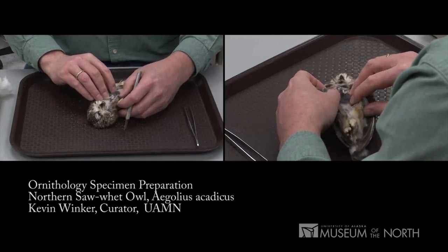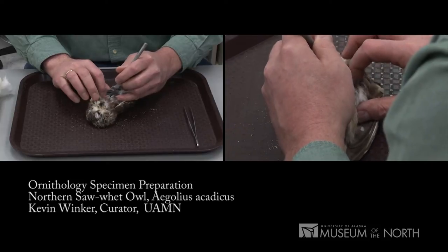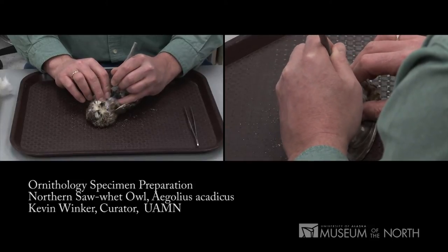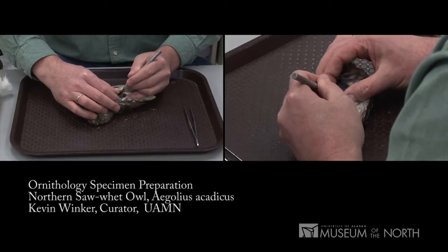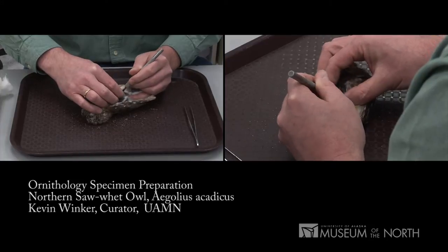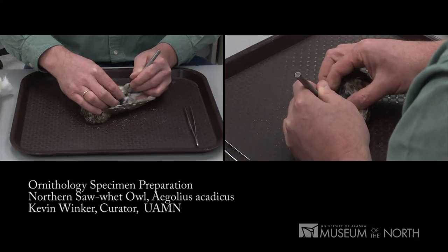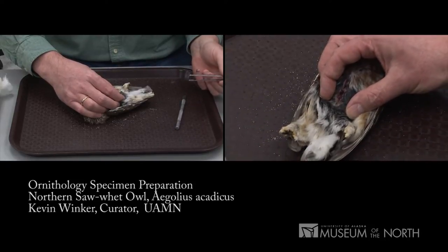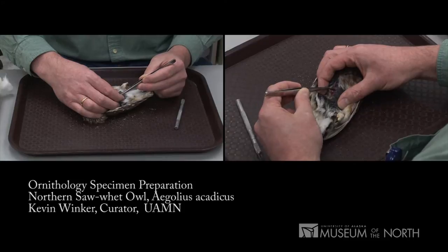Now I'm going to very gingerly move the feathers away from the ventral line of the bird and make an incision from the base of the furcula — up near the wishbone — to effectively the cloaca. It's going to be a little difficult to see because this is such a fluffy bird. I'm making that incision here, being careful not to cut through the abdomen wall because I don't want intestines coming out. The only instruments I like to use at this point are a pair of forceps and a scalpel, and eventually scissors.